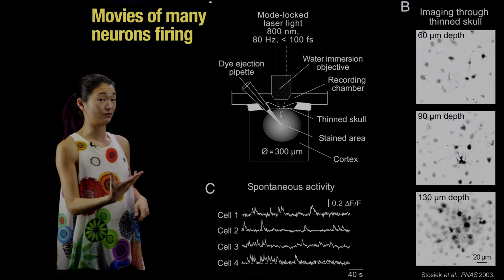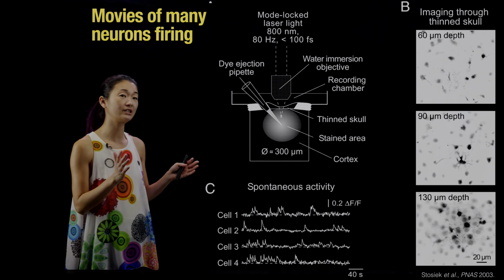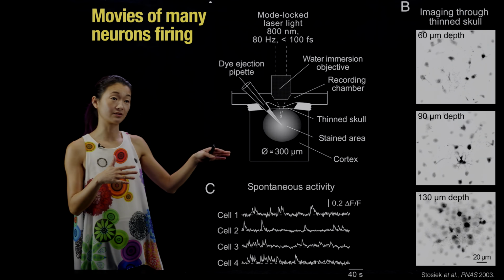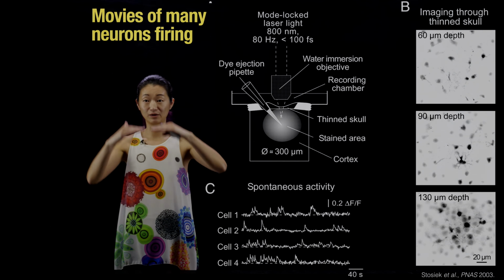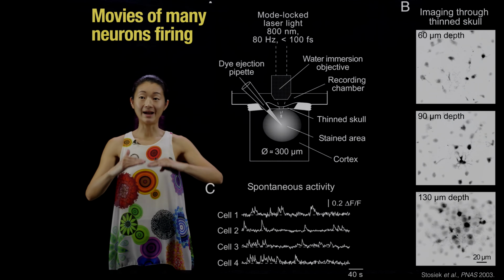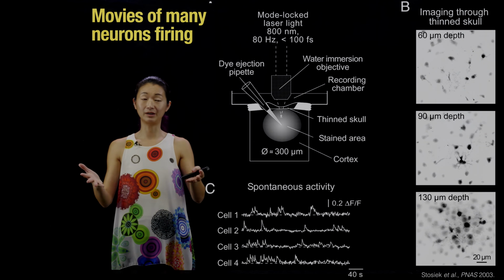With movies of neurons, however, because now we've turned this into an optical problem, you can actually just use microscopy tricks to image cells that are close together and then change the focal plane of your microscope to see a Z-stack of neurons at different depth. Okay, you can make yourself a little volumetric movie of neural activity.